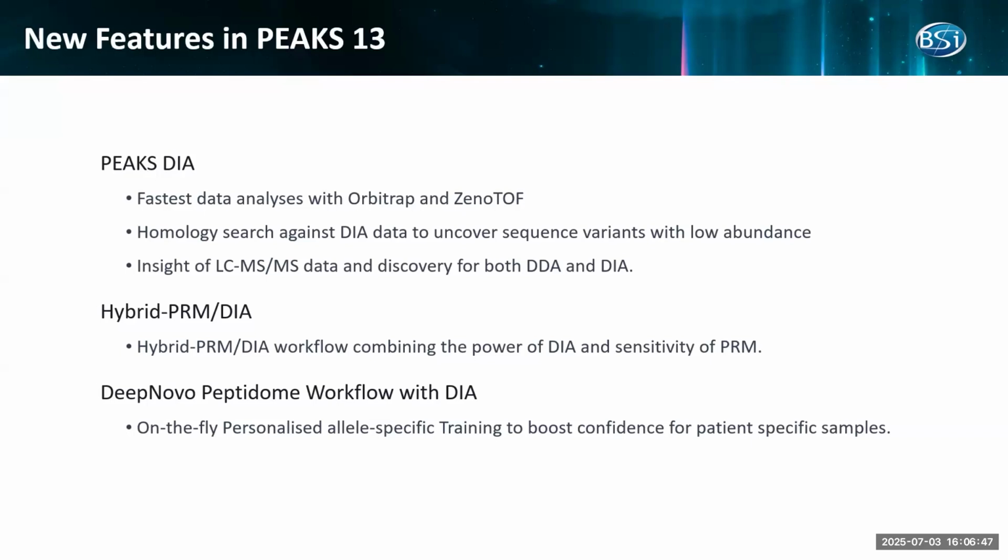Another thing is that currently in the community there is a bigger concern about FDR estimation for DIA data. Most of the engine software are black boxes. We try to provide detailed insights into the data along with the result, for researchers to validate and view, such that they are confident about the result.